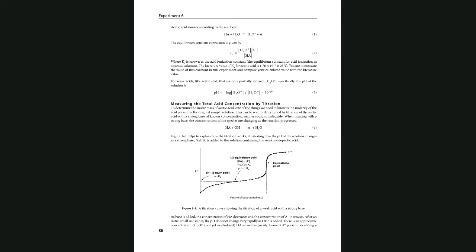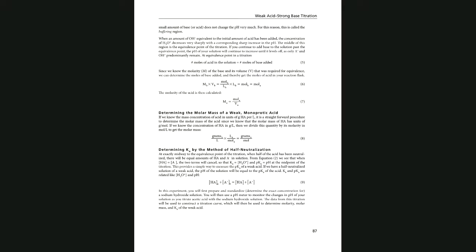The strong base that we are using today is sodium hydroxide. Sodium hydroxide is not very stable. It actually absorbs moisture, and the mass is not stable. So if I just measure the mass of the sodium hydroxide to make a solution, it doesn't give me a reliable number for the concentration. It's not an accurate concentration. So I'm here preparing sodium hydroxide solution.